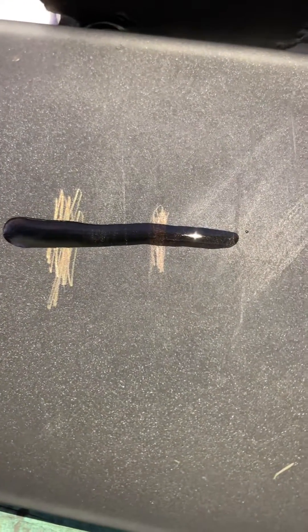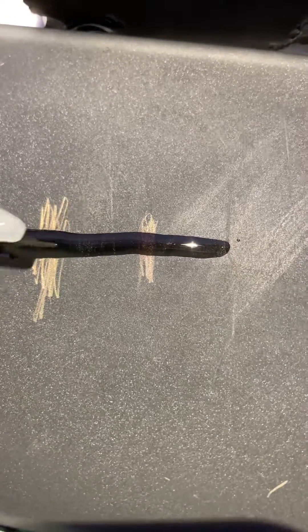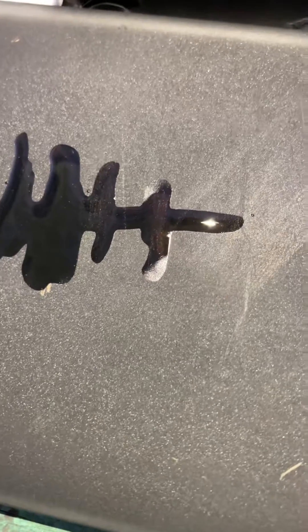We're going to use 14 carat acid so you can see how this works. You can see that the 8 carat streak remains, but the brass — the acid eats it up instantaneously. The streak still remains and it's a really rich, dark color.